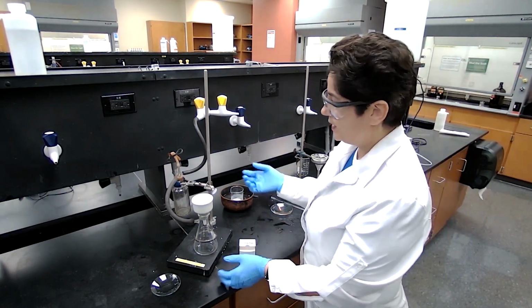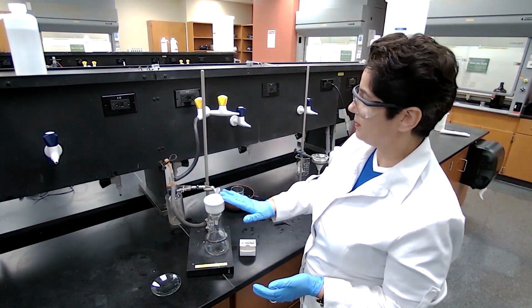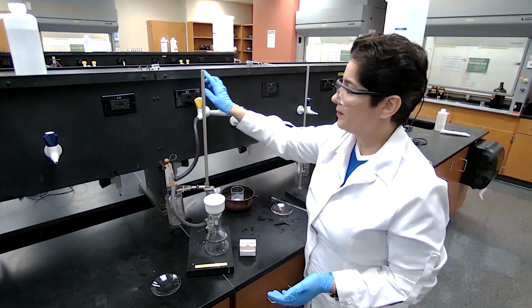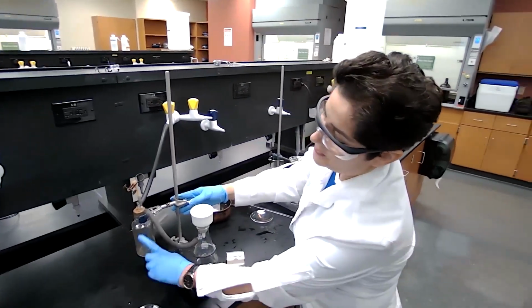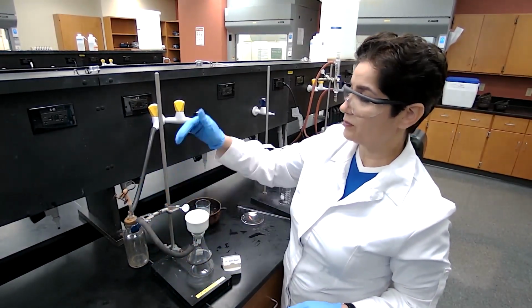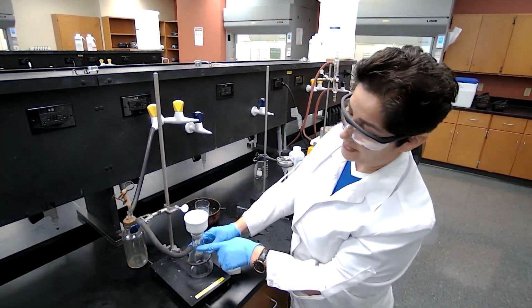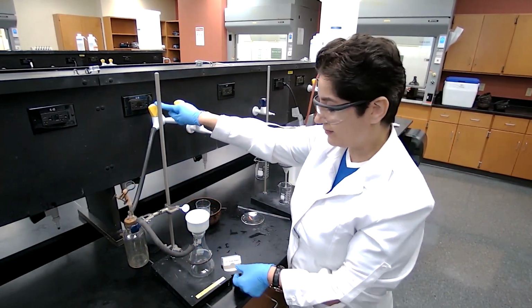For that, we first want to connect the vacuum filtration apparatus, the Buchner funnel, to the vacuum system. This is the vacuum valve. We want to place a trap. The purpose of the trap here is to make sure that no liquid goes into the vacuum system. When you have a trap, you connect one of the hoses to the vacuum flask and the other hose to the vacuum valve.